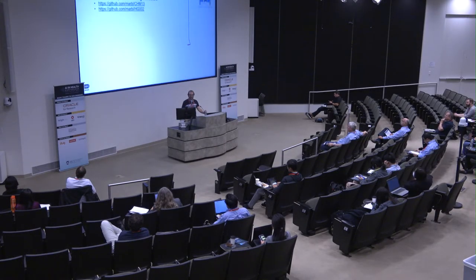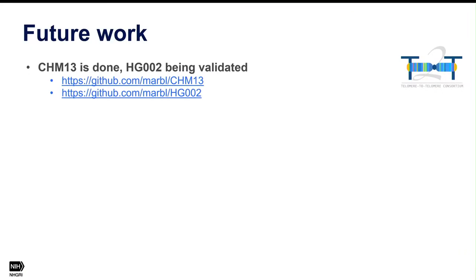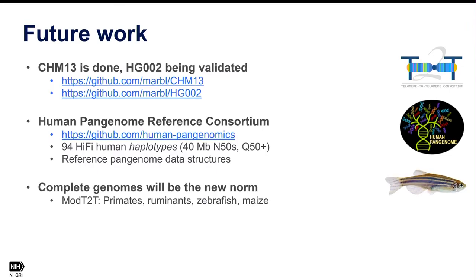To finish with, I showed you CHM13, which is the one we published this year, and it is done. HG002 is also available, and is in the process of being validated. We want to make this, together with the Genome in a Bottle Consortium and the HPRC Consortium, the gold standard genome, so we can finally have a truth set both for sequencing and for variant calling for the entire genome, not just for the 90% that we had from the previous reference. The Pan Genome Reference Consortium is generating hundreds of these extremely high quality human haplotypes. We're planning to run all of these through our pipeline with Verkko and improve them even further.